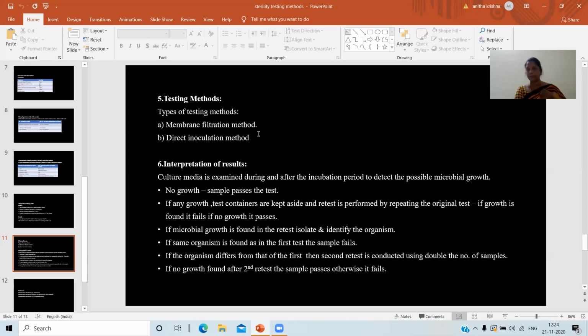If it is an ointment or a cream, you have to take the sample and use fluid B, because it is an oil or ointment, a creamy substance. Take 1 ml of the sample and add it in 1:10 ratio. From that, take 10 ml of the sample and add polysorbate 80, the diluting emulsifying agent, then take 10 ml of the sample and add it to 80 ml of your medium, and then incubate it. That is one of the modifications.